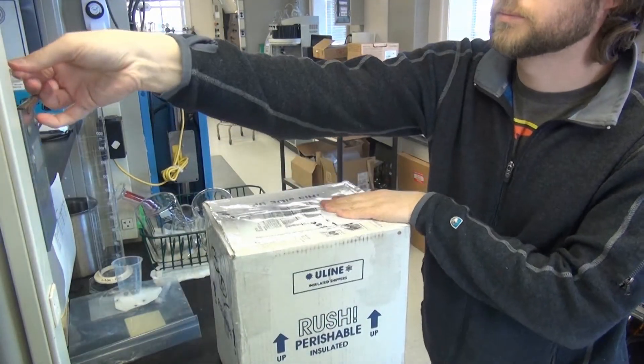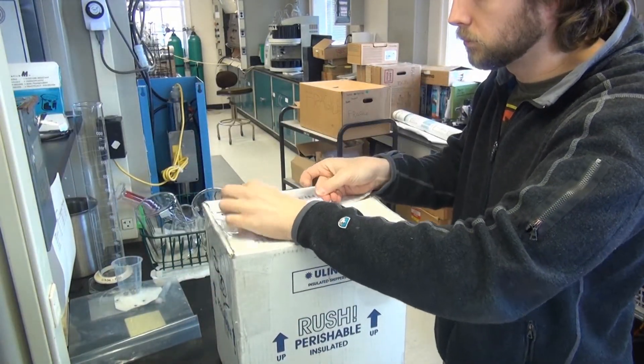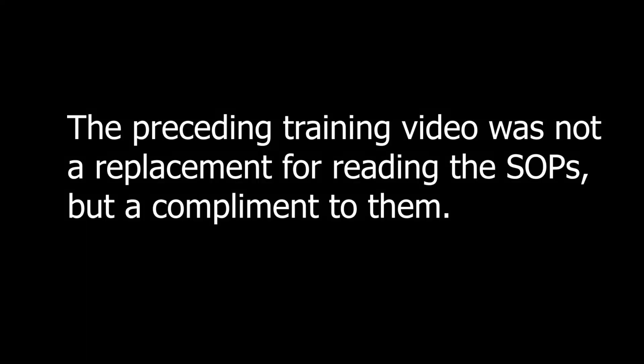Securely seal the box and ship it. The preceding training video was not a replacement for reading the SOPs, but a complement to them.